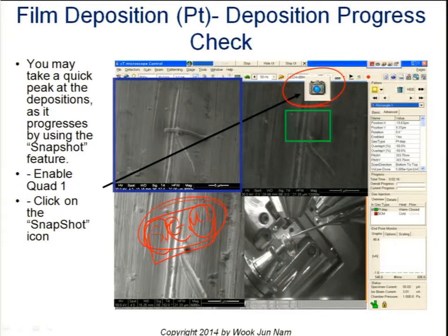So we just take a very quick snapshot and see the progress, and using those discontinuous snapshots, we can monitor whether the deposition process is happening as we wanted.